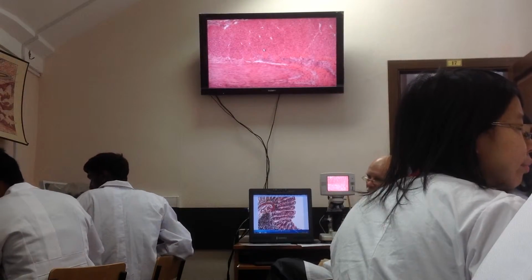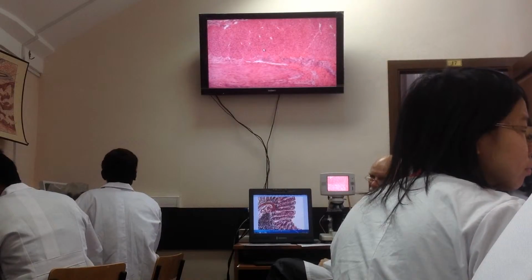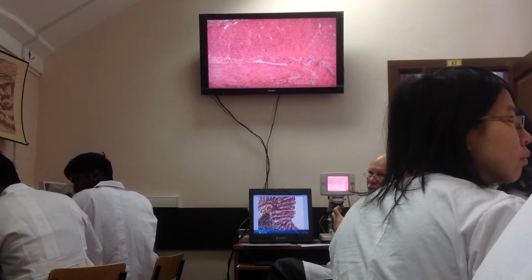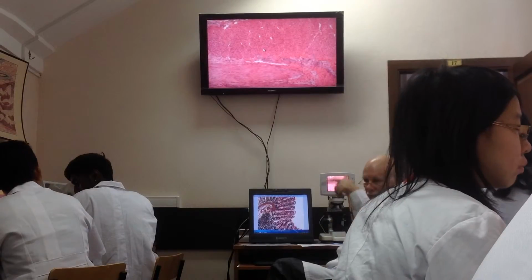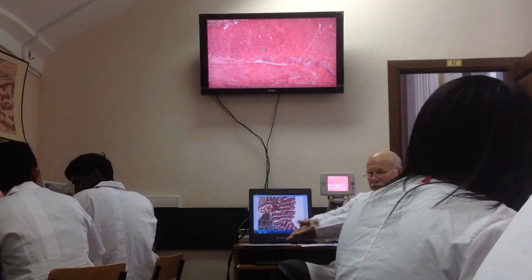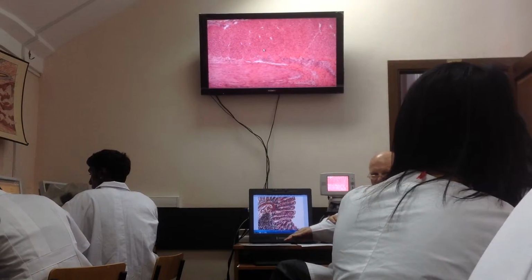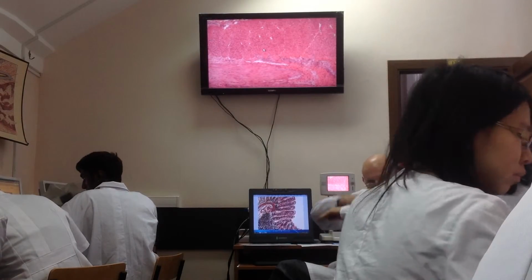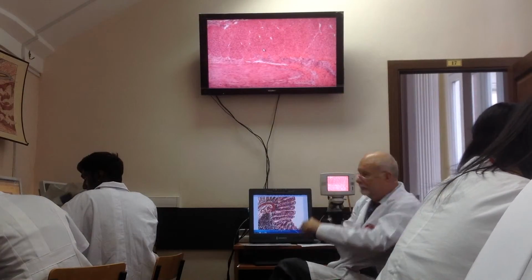What is the disposition of muscle cells? Smooth muscle cells. How are the smooth muscle cells oriented in the layers? Longitudinal and circular. The inner layer, it's intestine, small, large, a tubular-like organ. The inner layer of smooth muscle cells is circular. The external layer is longitudinal. Understand?